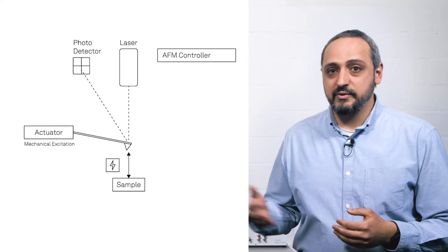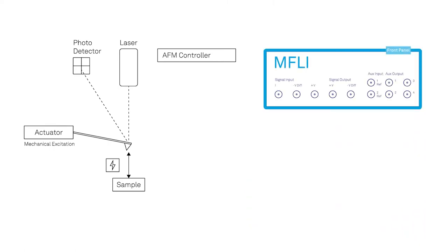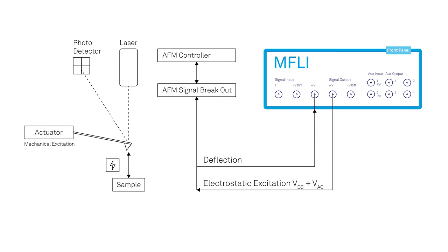To enable the KPFM methods on this Nanosurf Flex AFM, we connect a Zurich Instruments Lock-in Amplifier. The workflow is very similar for most microscopes. Typically, a signal breakout board is needed for easy access to signals like the cantilever's vertical deflection signal. It also enables the Lock-in Amplifier to drive AC electrical excitation signal and DC bias voltage of the tip or the sample.